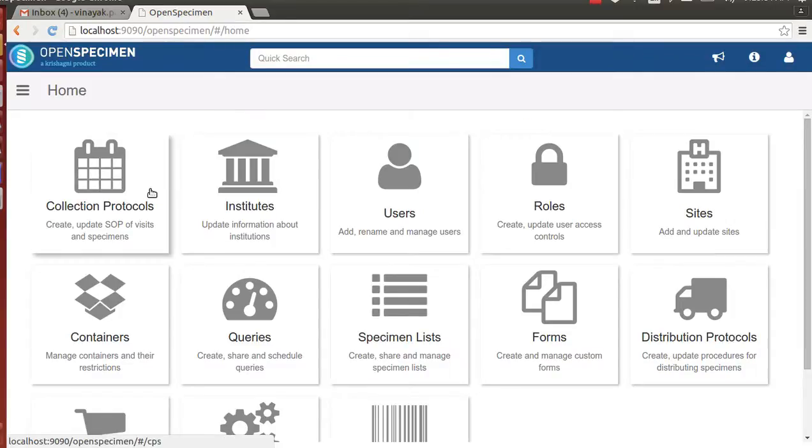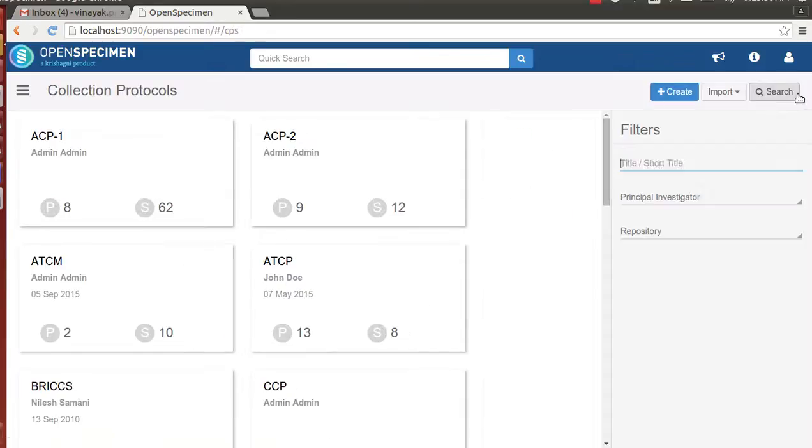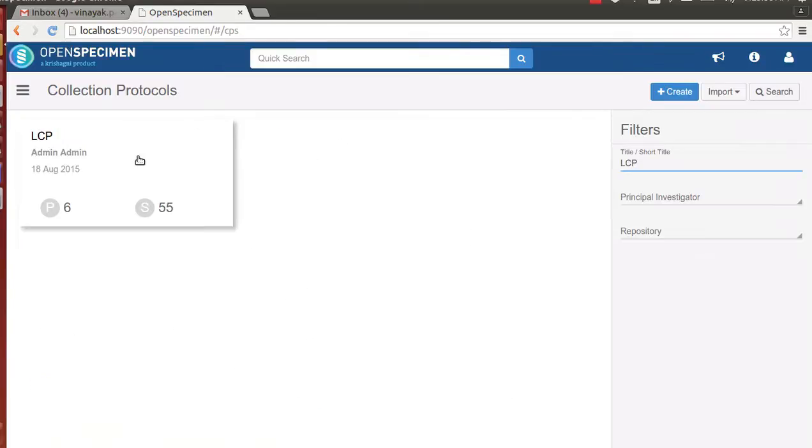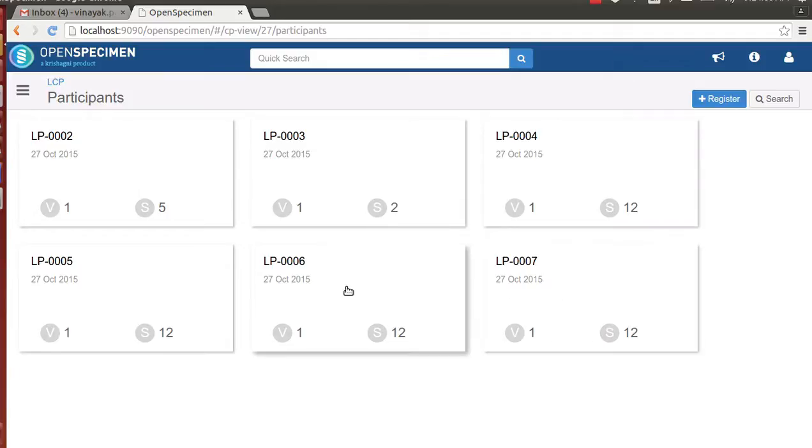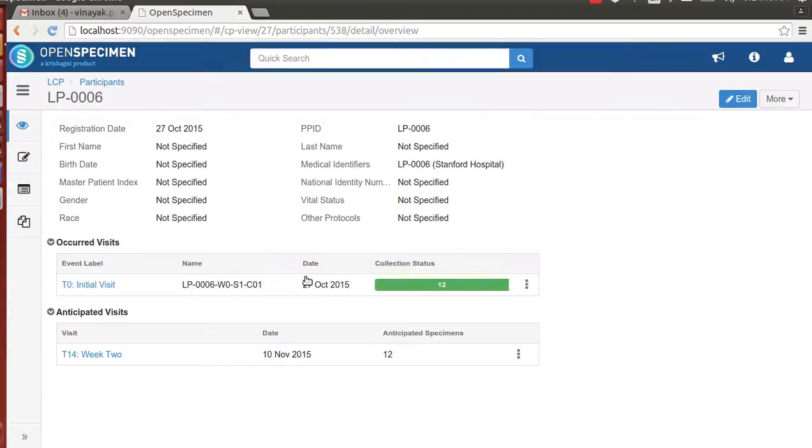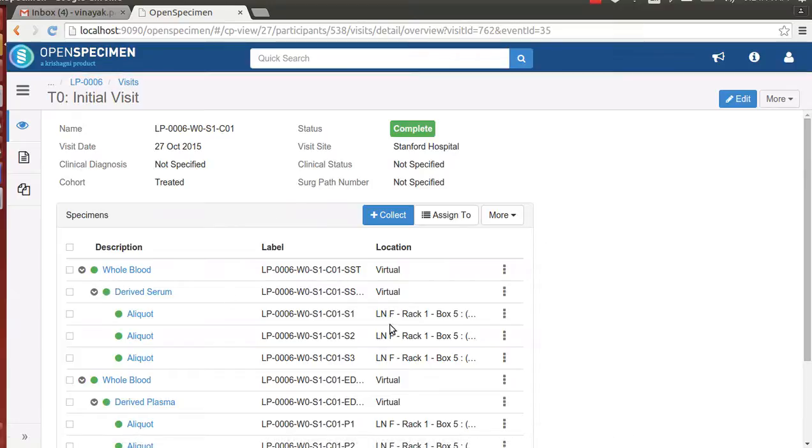We can review whether the patients and their visits got created or not by going to the specific study here. LP006 and LP0007 were the two patients whose specimens we collected. We can review the patient details here and the visit details.